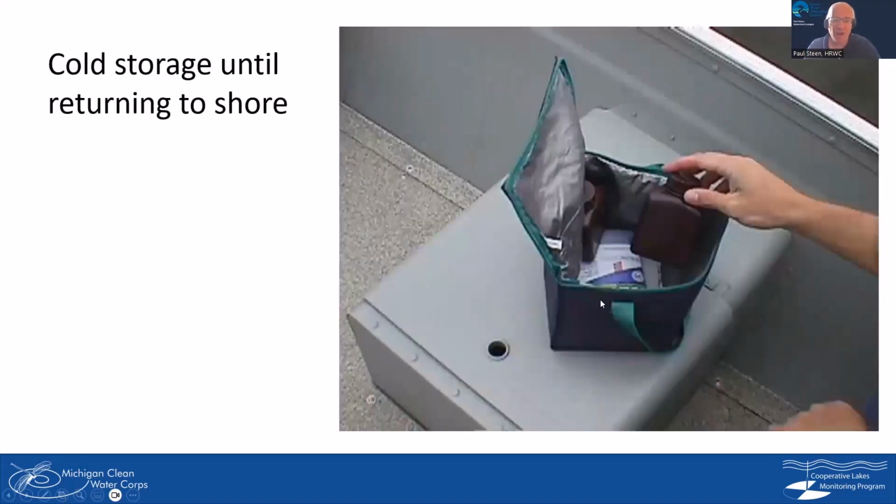And then this is why you have a cooler pack. Put everything on ice, or at least in a cooler, to try to slow down the biological productivity. And then you'll go back to your house, because the next step is done in your kitchen.